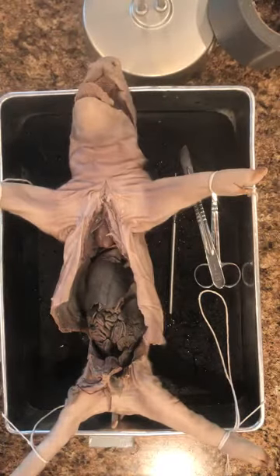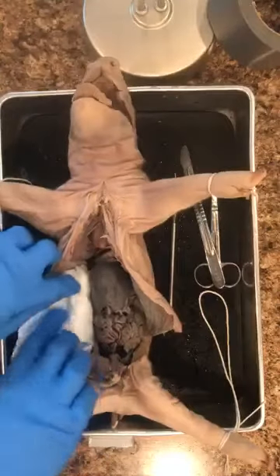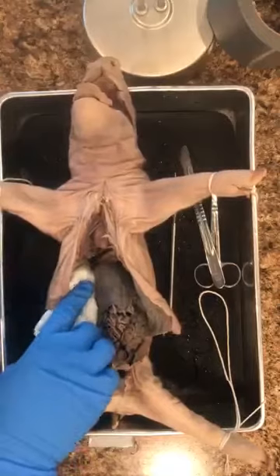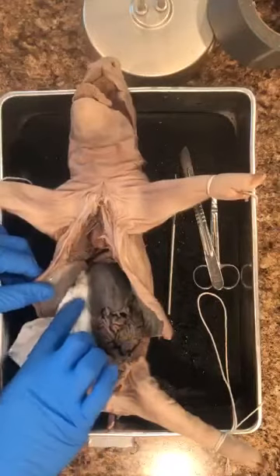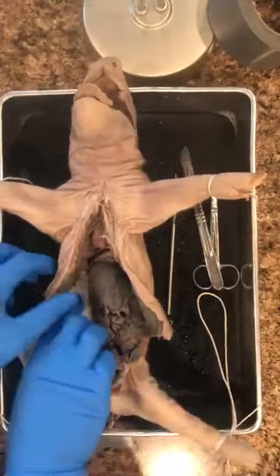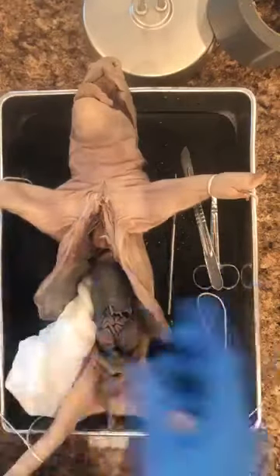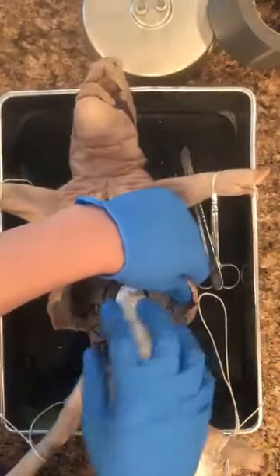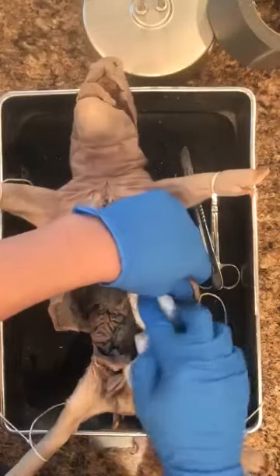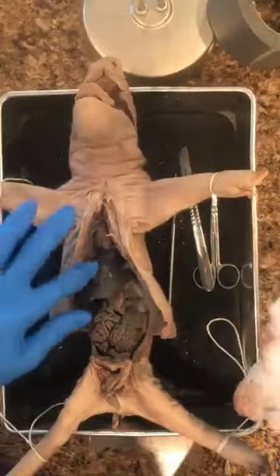Okay, and I'll show you a better picture here of the diaphragm and another picture of internal pigs. The pictures I show you are really good so you can compare one pig to another, because like I said, they're not all the same. I remember when I was in anatomy and physiology in college, we did our lab practicals, so we had to be able to identify basically any part of the cat and the dogfish shark, and when you looked from one to another, I was like, oh my gosh, this looked so different. Oh my gosh, this is so beautiful. Okie dokie smoky.